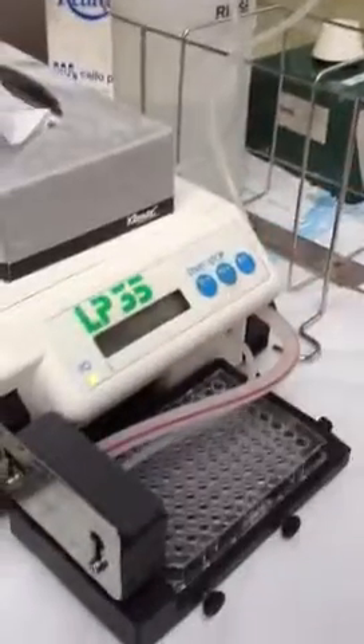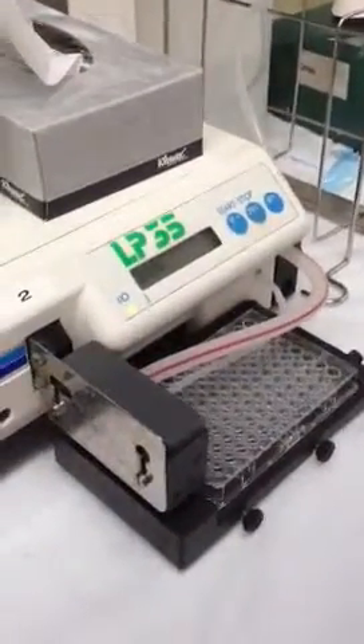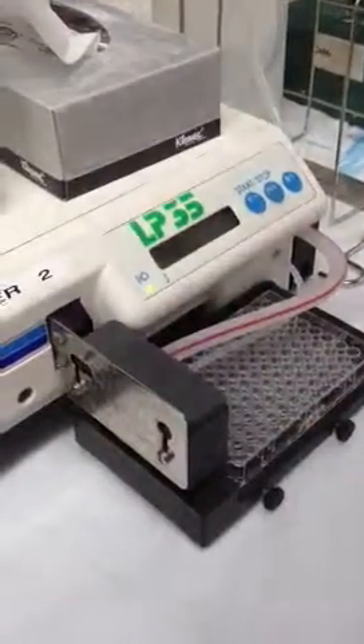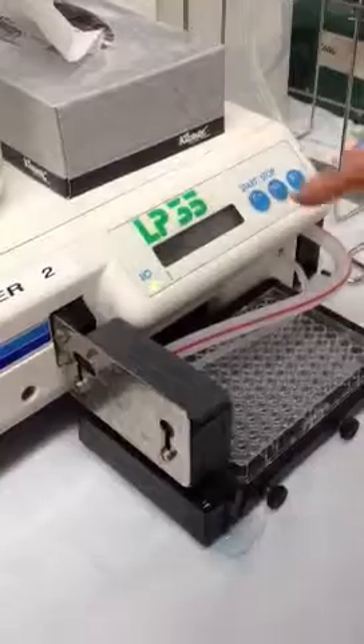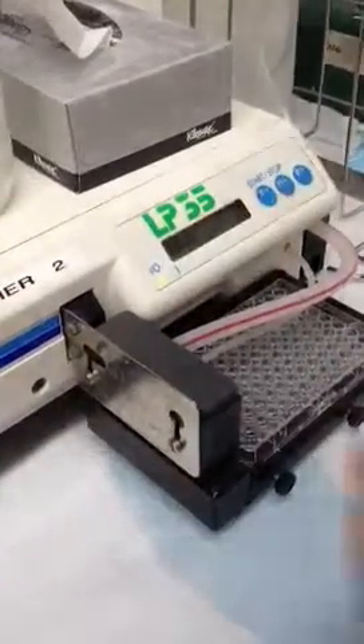So this is the rinse cycle. All you've got to do is just press start and that'll rinse. You can hear it — you can actually hear it change in a moment. It's not rinsing, okay? It's not sucking up. So something's not quite sealed properly.